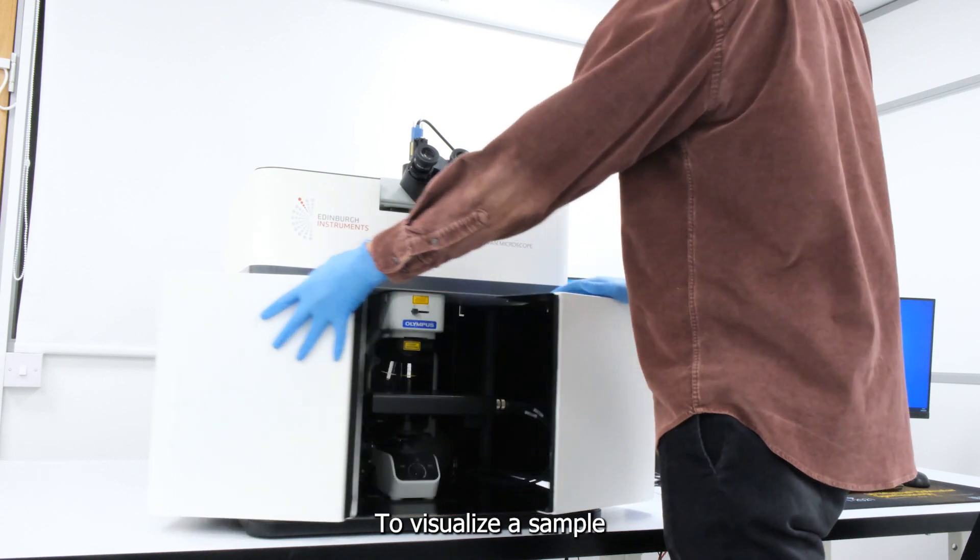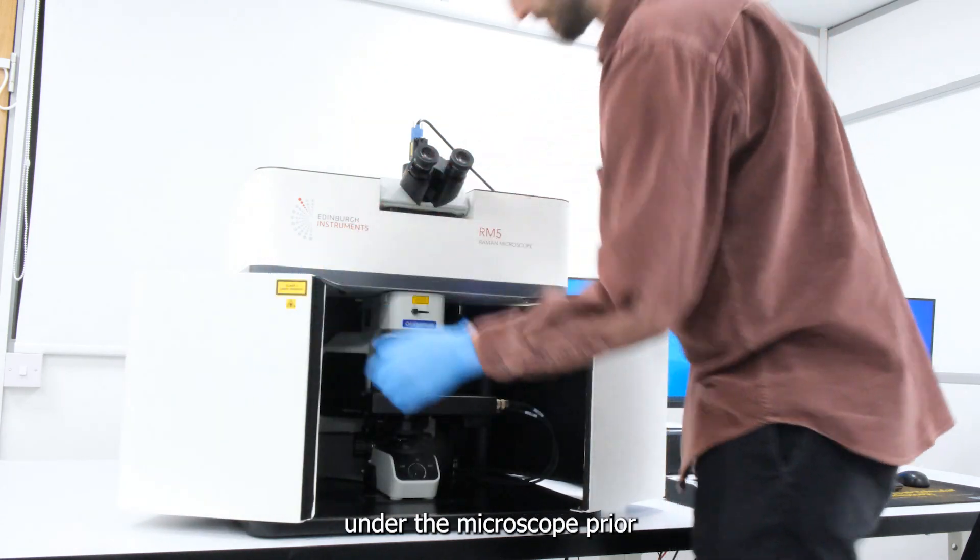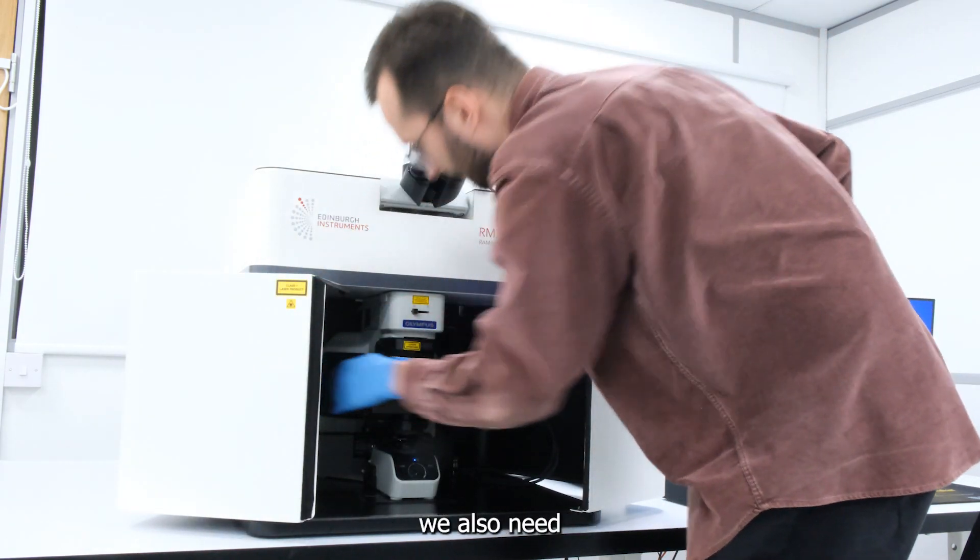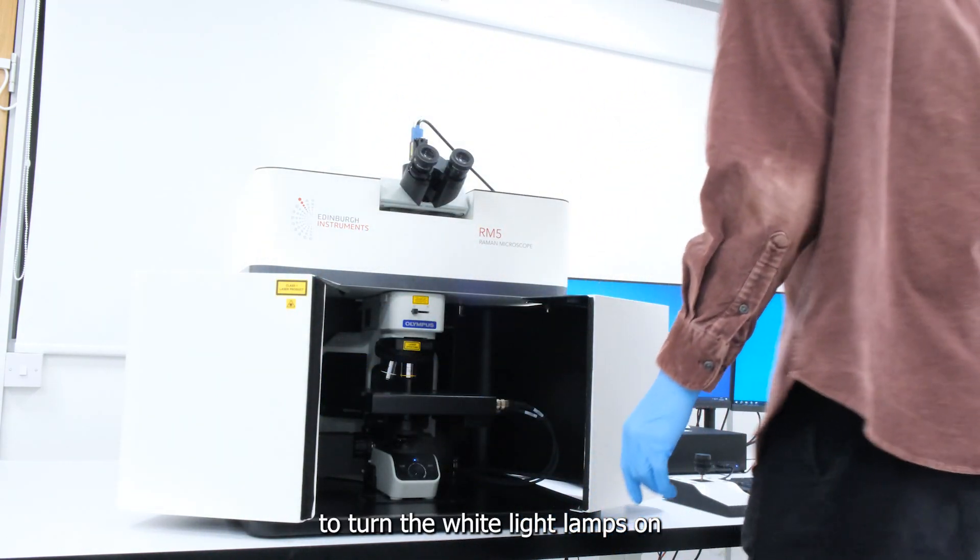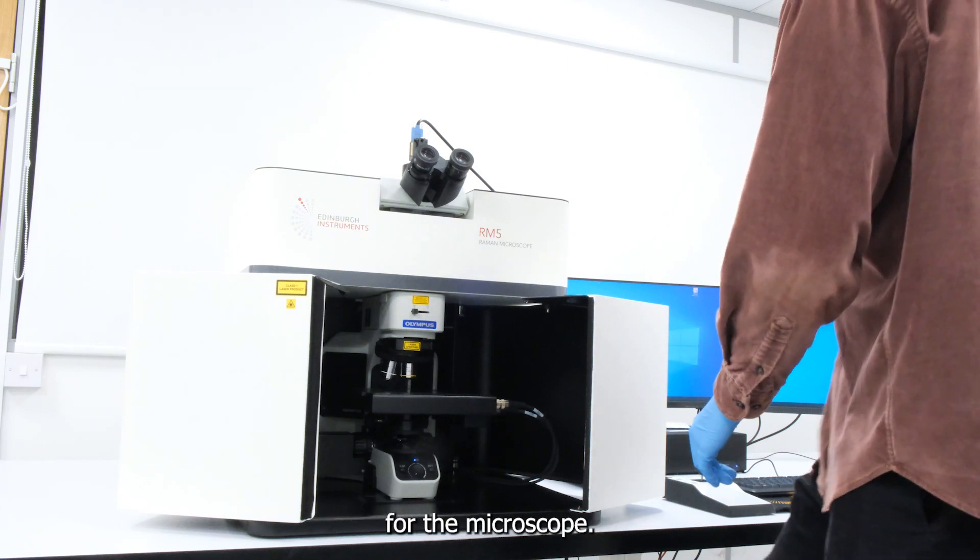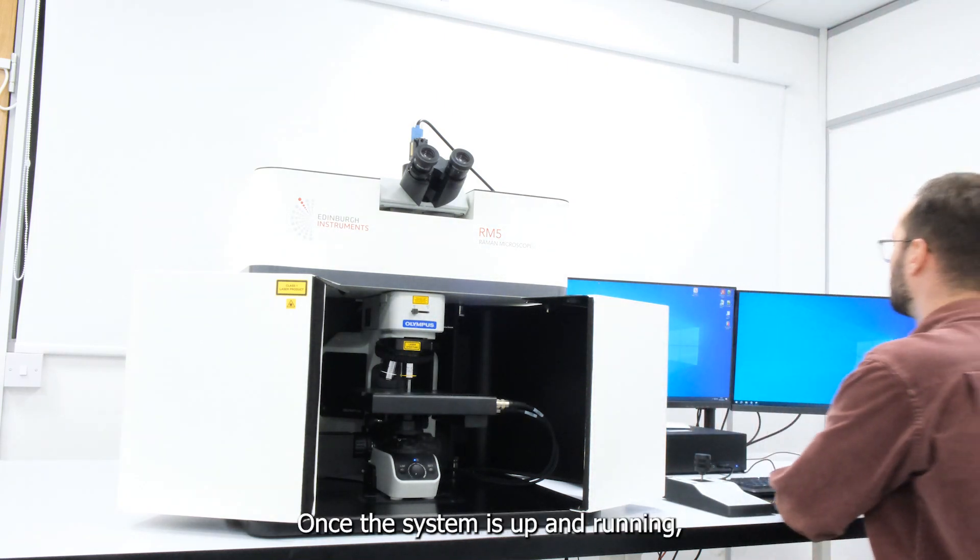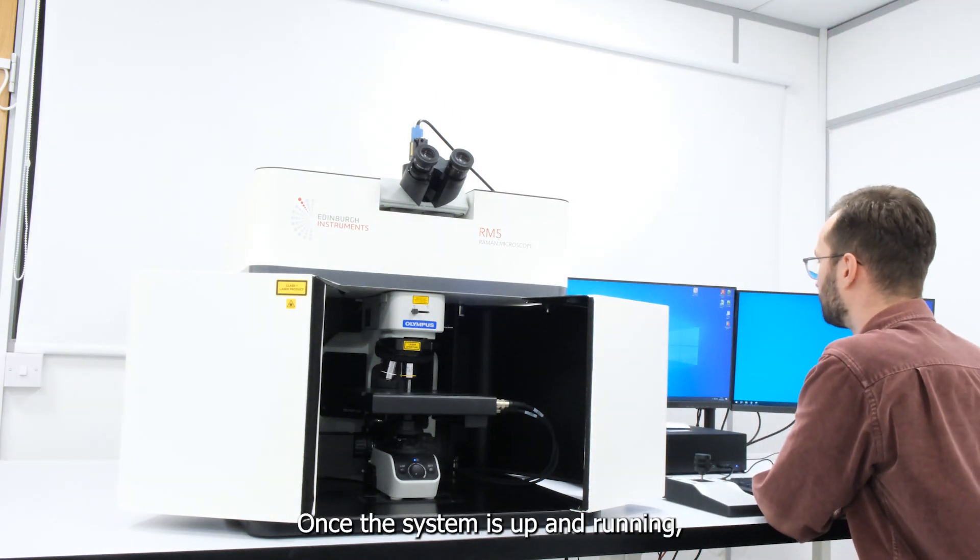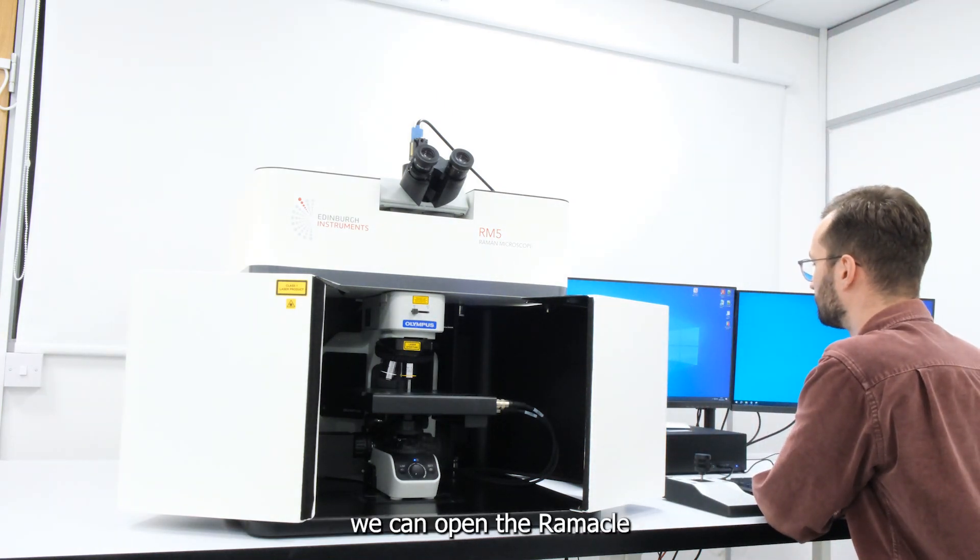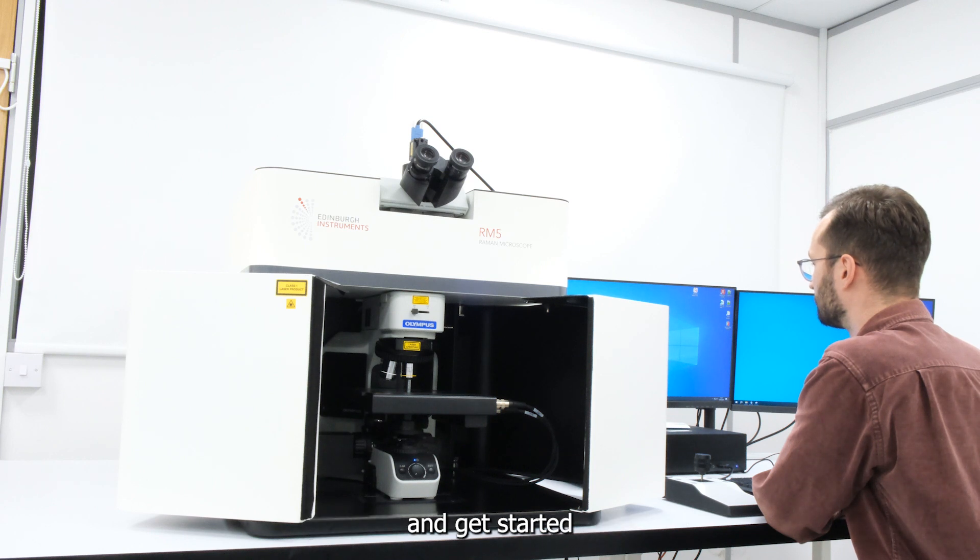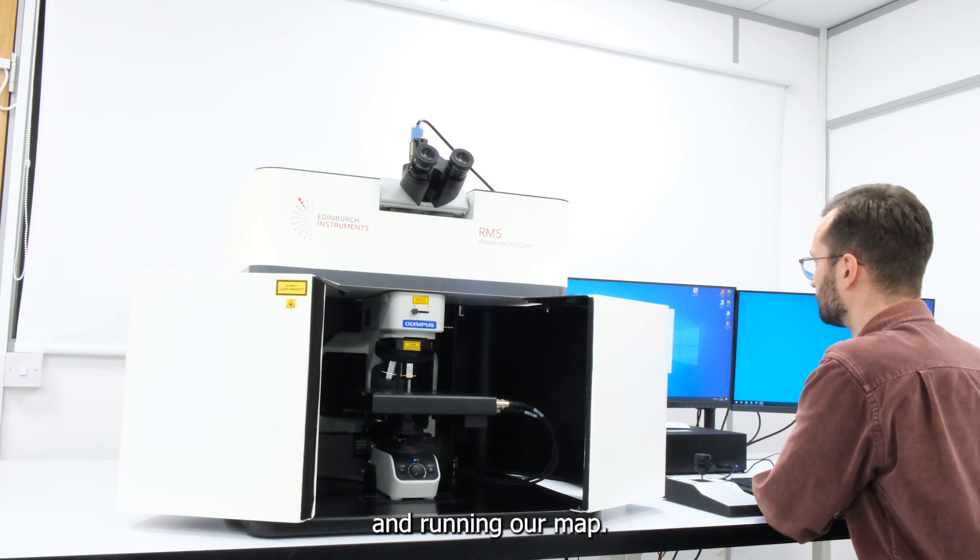To visualize the sample under the microscope prior to Raman imaging, we also need to turn the white light lamps on for the microscope. Once the system is up and running, we can open the RAMICAL operating software on the computer and get started with setting up and running our map.